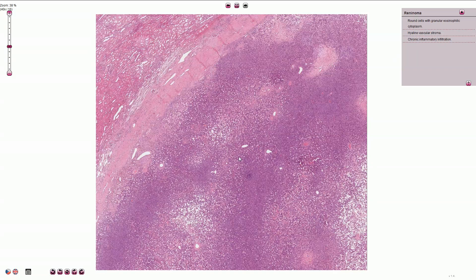Reninoma is a tumor derived from the cells of the renal juxtaglomerular apparatus and is also sometimes called juxtaglomerular cell tumor. It is typically associated with renin secretion, and high levels of renin then lead to hypokalemia, hyperaldosteronism, and also hypertension.